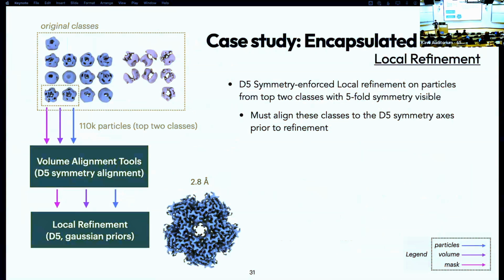Yeah, so I didn't try that because I think I was convinced that there was D5 symmetry from the paper. But actually, that would be a very good point, is to just not impose symmetry, not bake in anything at this point, because we've gotten so far without doing anything symmetric yet. And then let's say without D5 symmetry, okay, you're removing 10, you're decimating the number of particles you have. But presumably you could have gotten to decent resolution without that if you gave them the same particles, just not enforcing symmetry. So that would be a good step to do, for sure.